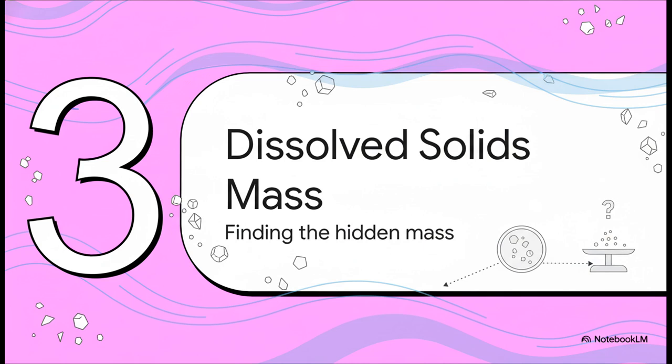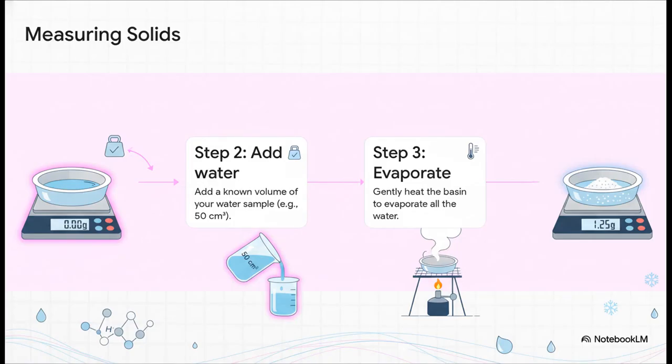All right, next up, we're going to do a bit of detective work. We're going to find out just how much solid stuff is hiding dissolved in our water. You can't see it, but it's in there. And this practical shows you exactly how to measure it, a key skill you'll need to be able to describe. Now, the method itself is actually pretty straightforward, but you've got to be careful with every single step.